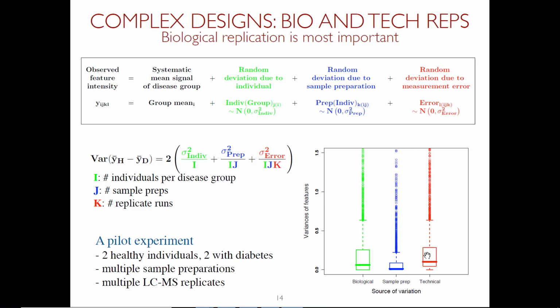So suppose you have 3 runs, then you would see protein A in these 3 runs. If I have one protein in 3 runs, and I have different kinds of sample prep and so on, I will have for this protein all of these variance components. For the next protein, I will also have these 3 numbers, which are specific to that other protein. For the next protein, other 3 numbers, and so on. So I have this quantity separately for each protein. So if I have 1,000 proteins, I will have 1,000 of these variances. I'll just put them in the box plot here. So you fit this model for each protein. So this model here has this variance component, this variance component, this variance component.